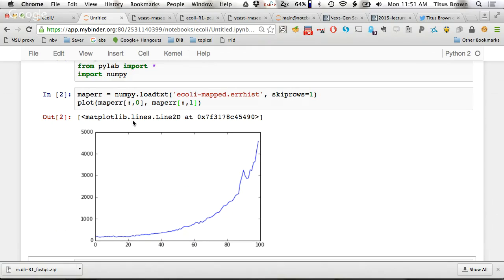What true variation would do is raise this. You'd have more mismatches on average across all of the positions due to real differences between what you were sequencing and the reference genome that you're mapping to. But the bias here is almost entirely due to errors.